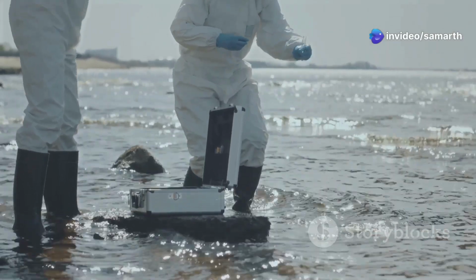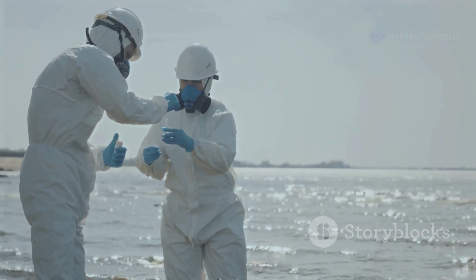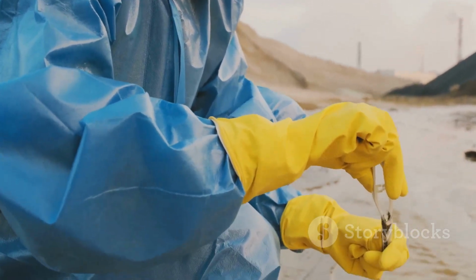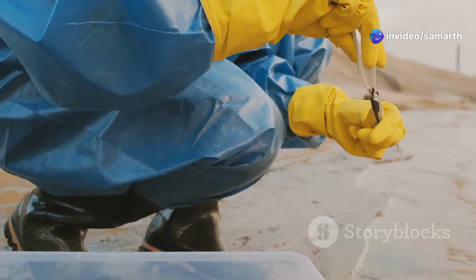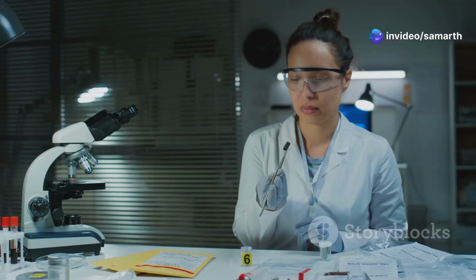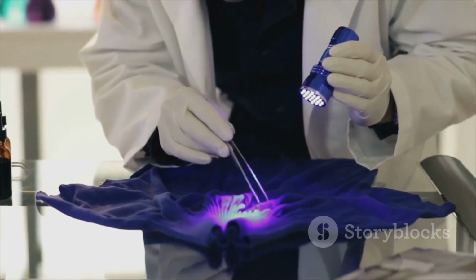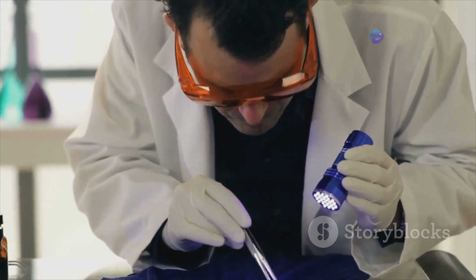2. In environmental science, environmental scientists rely on FTIR spectroscopy to monitor air and water quality. It helps identify pollutants, greenhouse gases, and other contaminants, enabling effective environmental monitoring and remediation efforts. 3. In forensic science, FTIR spectroscopy plays a crucial role in forensic investigations. It assists in analyzing evidence such as fibers, paints, and polymers, aiding in criminal investigations.